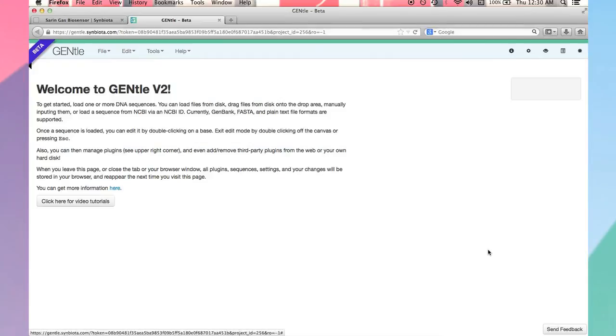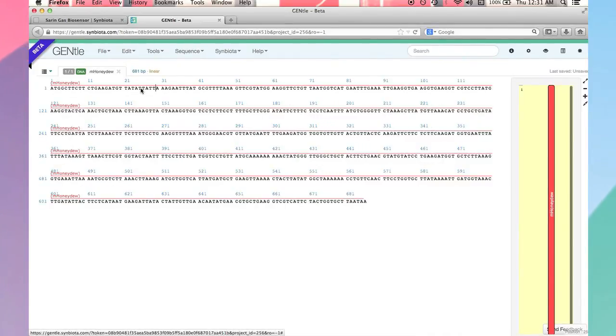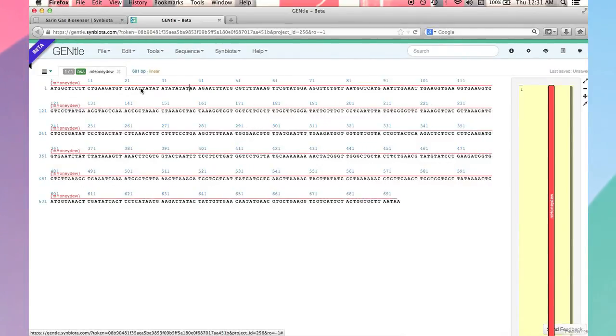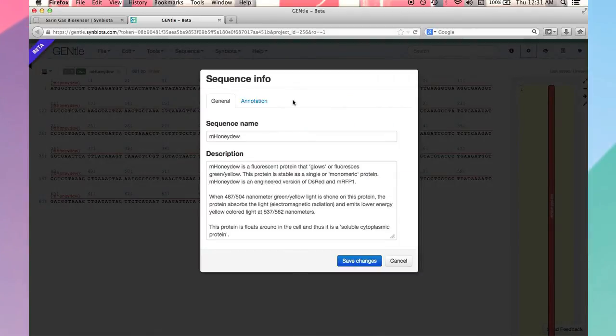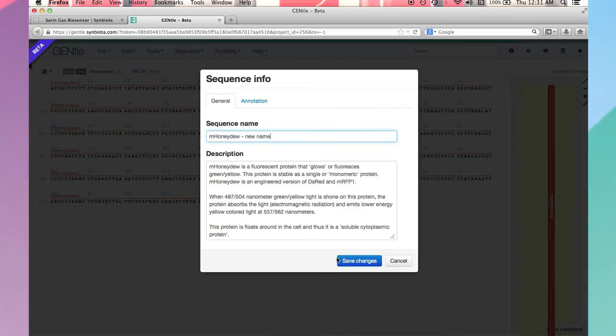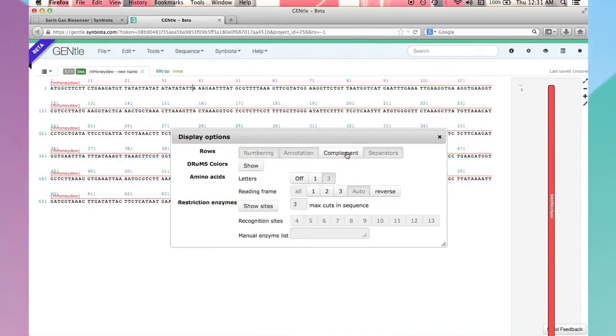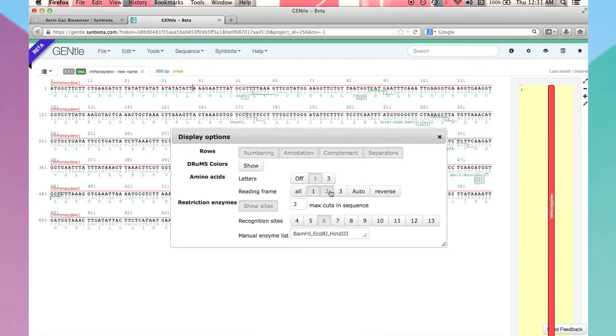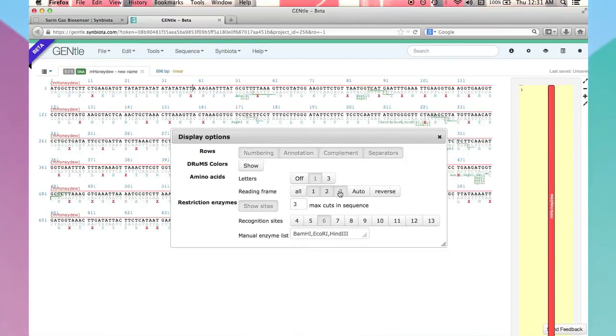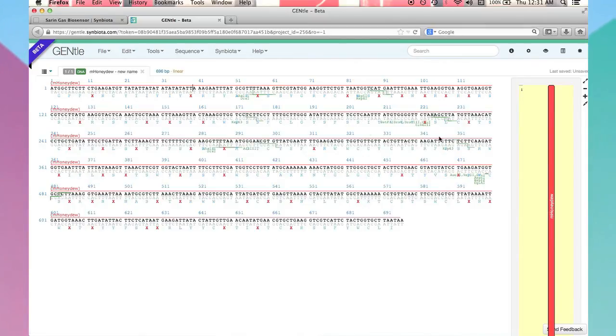Once loaded, I can edit the sequence, change the name and description, analyze for restriction sites or translation in different reading frames, and ultimately I can export to my computer or save to Symbiota.